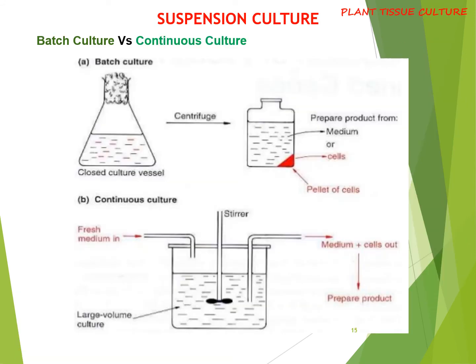The figure here shows a diagrammatic representation of a batch culture and a continuous culture. In the batch culture, the media is limited and it's a closed system.